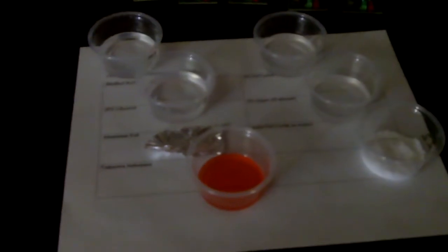Okay, so all we're going to do with the conductivity meter, just a little quick overview of what this is. You got a 9-volt battery. You have 2 copper metal leads here at the end, and you have an on and off switch. What we're looking for is the completion of a circuit. A circuit is when you have electrons that are moving in a circle. That's electricity. So what will happen here is that we'll have an outflow of electrons from one lead, and it'll flow back into the other lead and go up to the light and turn it on if the circuit completes. But you have to have ions moving in solution in order for that to happen. So that's what we're looking for, that conductivity, that light's going to come up.